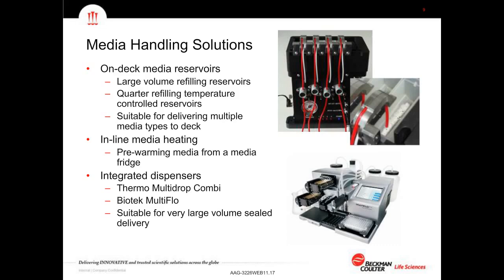To go with that, we can also do inline media heating. Clearly, if we're constantly refilling a reservoir on deck, then we might be delivering, if the media is stored chilled below deck, a chilled media into a warm environment, and we don't get a very good consistency in temperature. So we can actually warm that media as it travels towards that refilling reservoir, just to allow us to ensure that we're not shocking our cells with something that's a different temperature from what they're expecting.